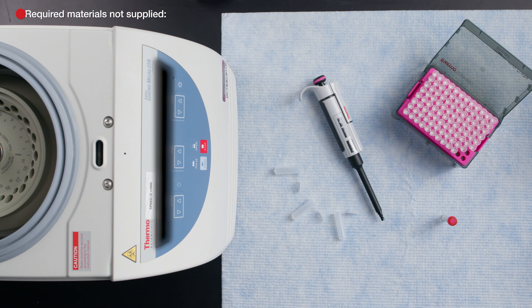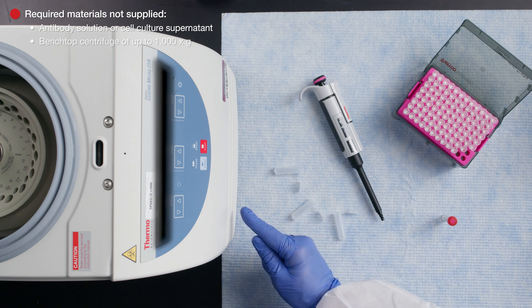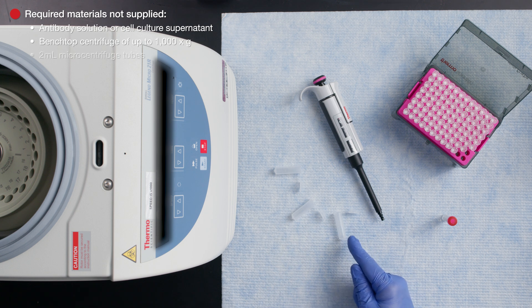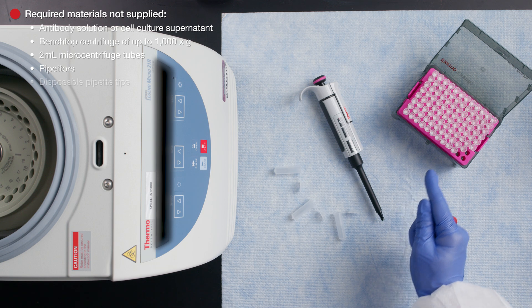You'll also need your antibody solution or cell culture supernatant, a benchtop centrifuge capable of up to 1,000 Gs, 2 mL microcentrifuge tubes, pipetters, and disposable pipette tips.